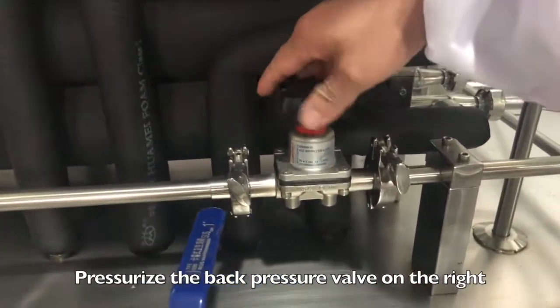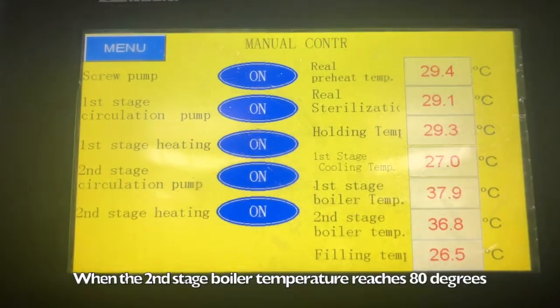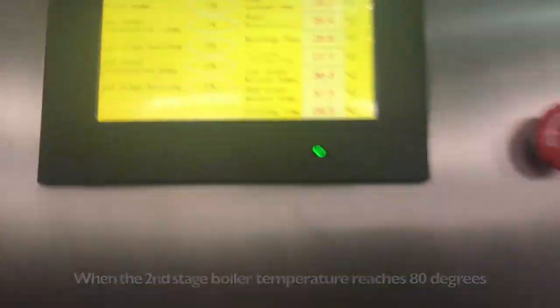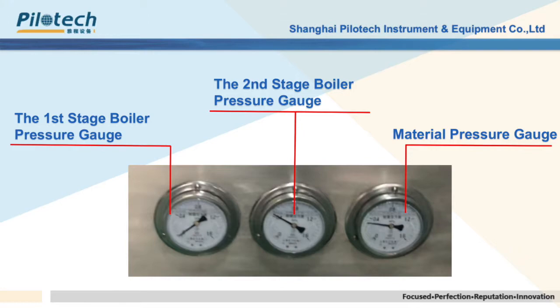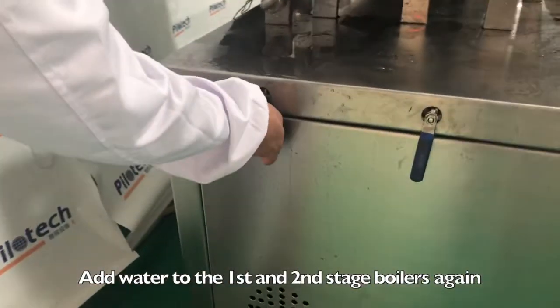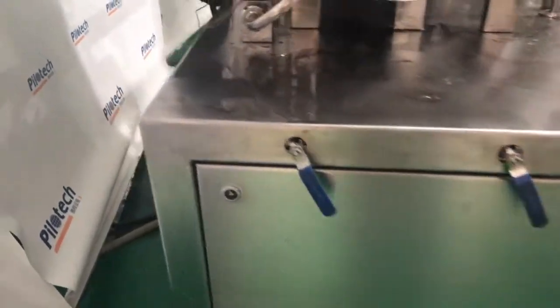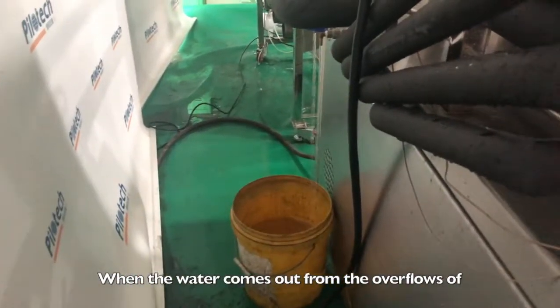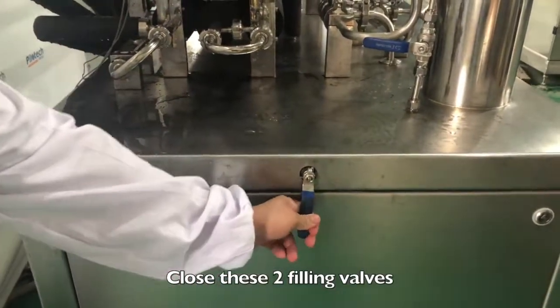Pressurize the back pressure valve on the right. When the second stage boiler temperature reaches 80 degrees, set the material pressure to 0.1 MPa. Add water to the first and second stage boilers again by opening their filling valves. When water comes out from both overflows, close these two filling valves.